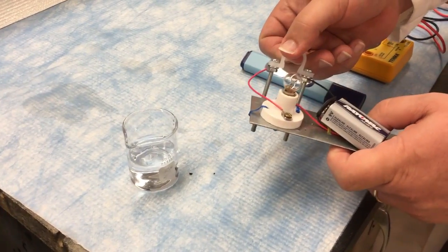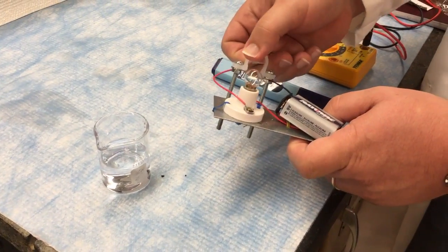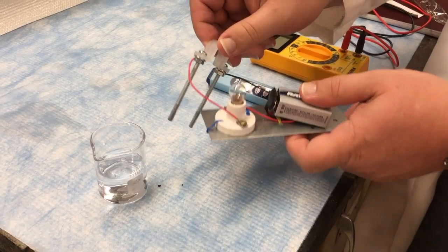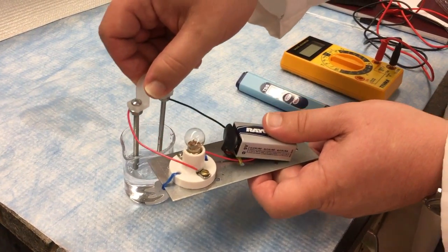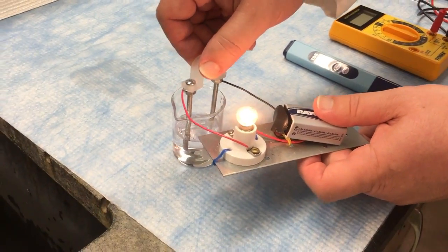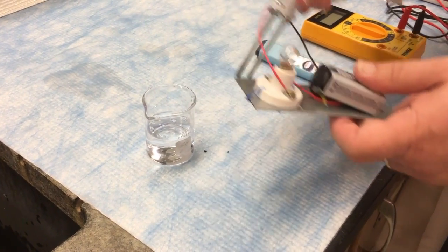So if there's a conductive material between the two screws here, between the leads, the light will go on. So let's check out the solution over here is conductive. Just immerse the two leads and you can see the light go on. Take it out and it goes off so it's all good.